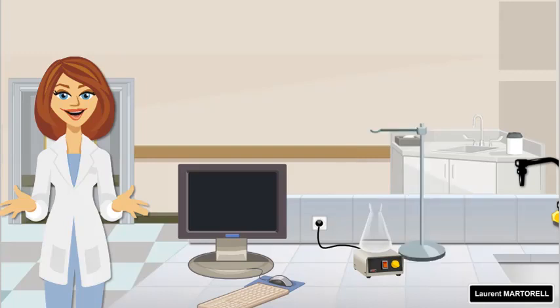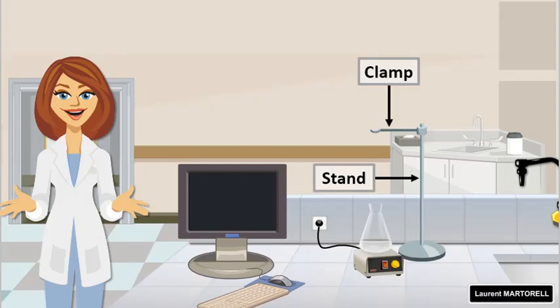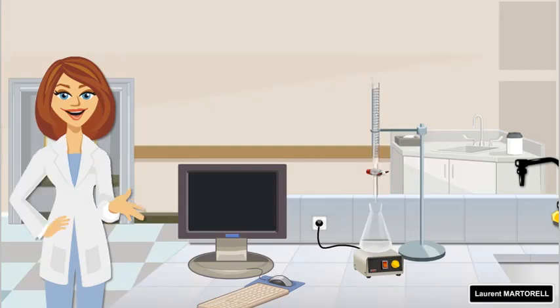The next equipment you need is a stand and a burette clamp. Then, you need a burette. The burette is mounted on a stand with the clamp.